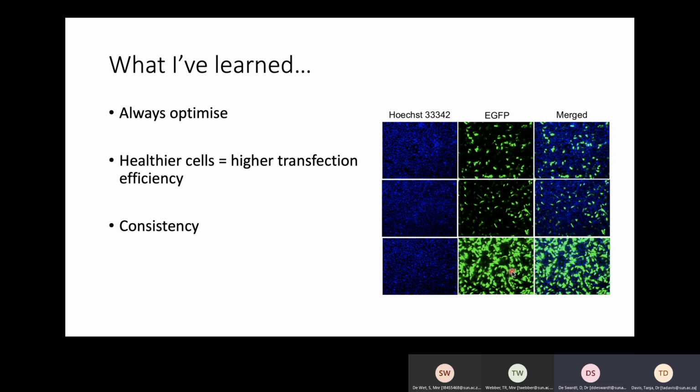So I'm quite surprised that they're seeing an effect that's good enough for them. But what I would suggest is using a transfection reagent so that the delivery to the cells is a little bit more optimized.